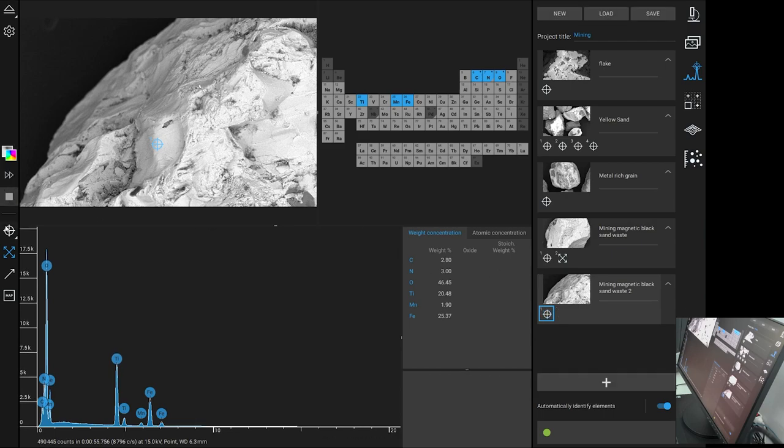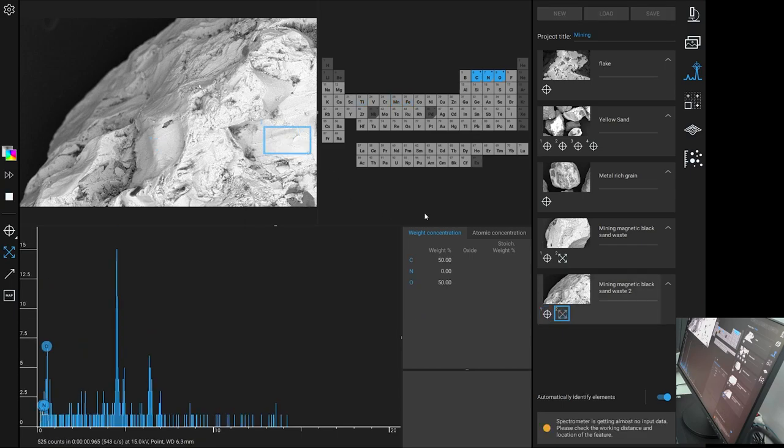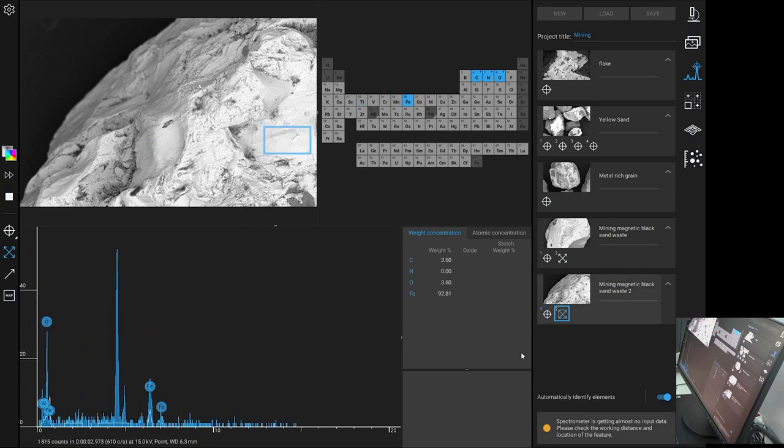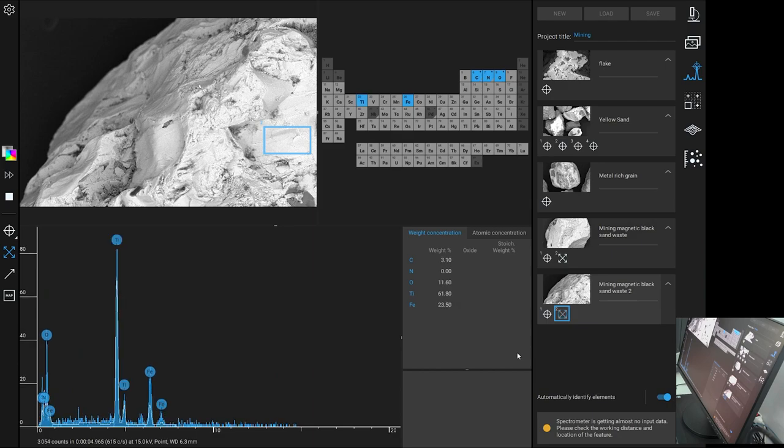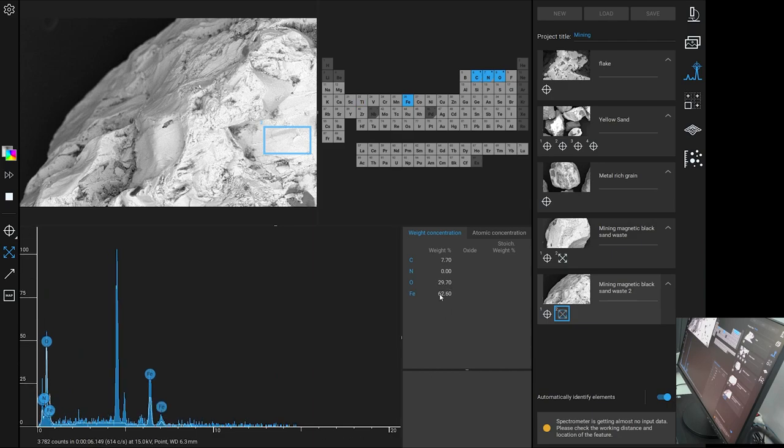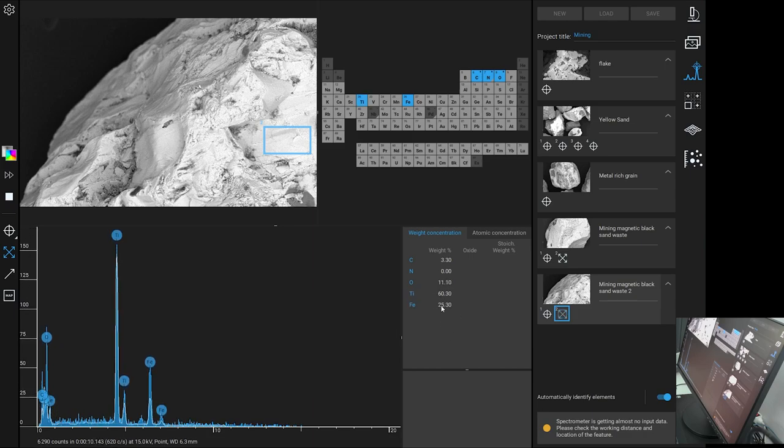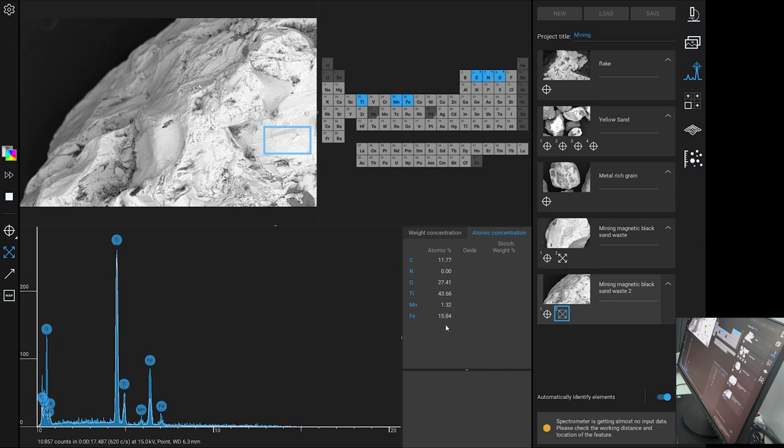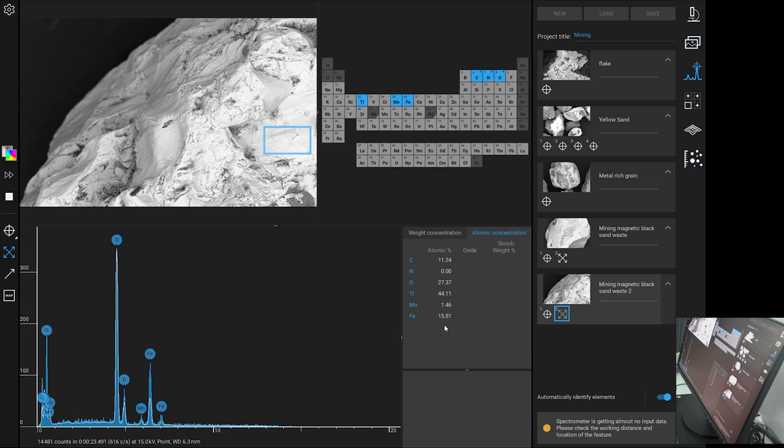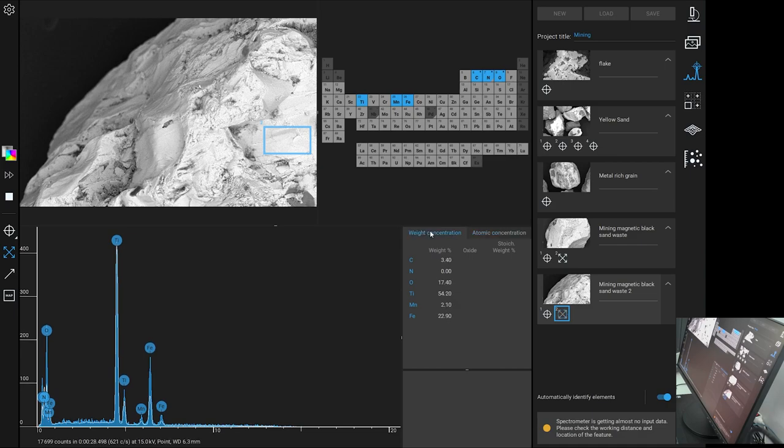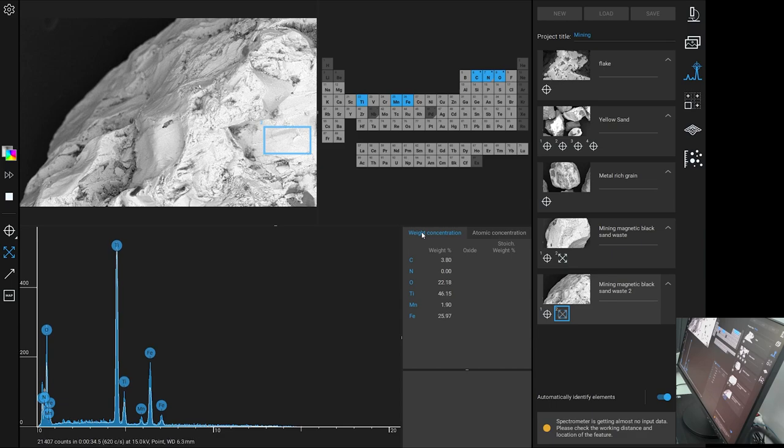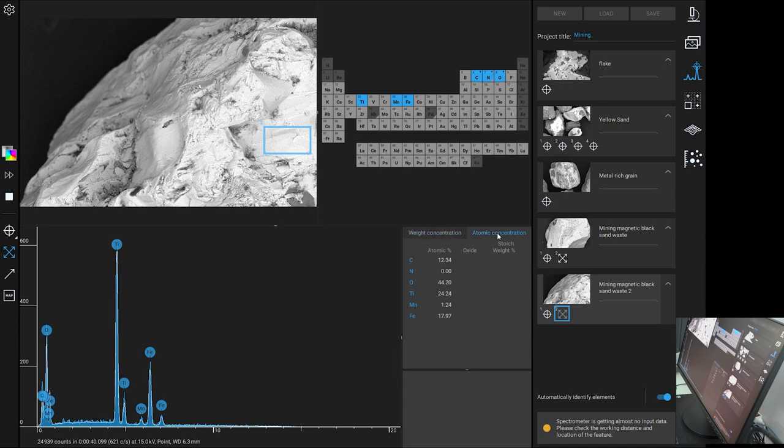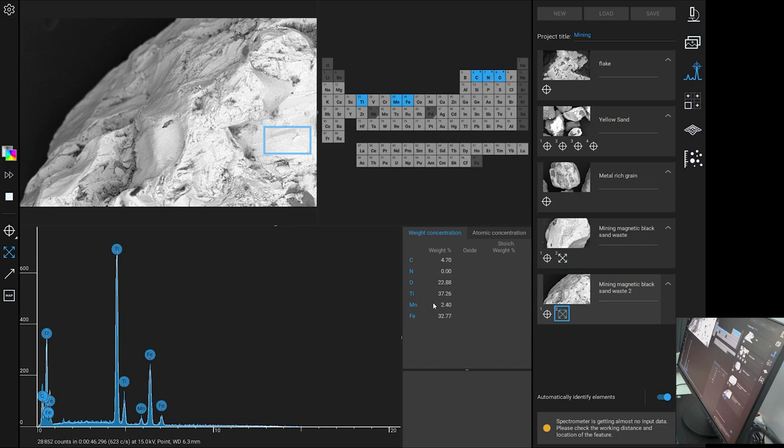And we will do an area. Do a little area over here. What are we seeing? Wow. Much more pure titanium and iron. Wow. This particular piece here is very rich in titanium.